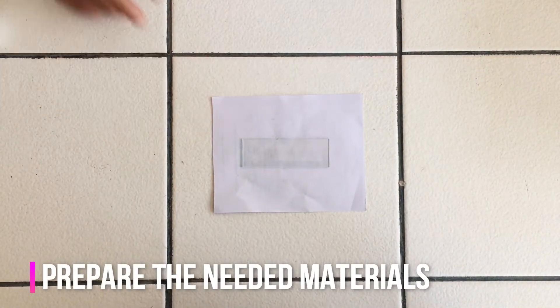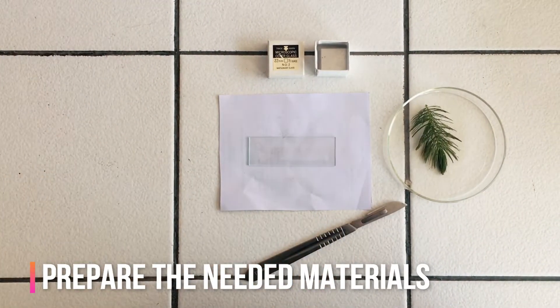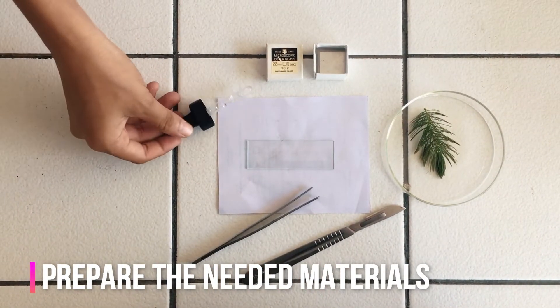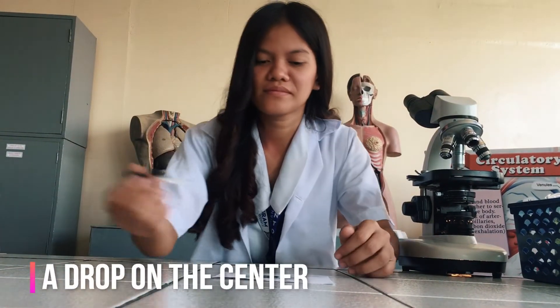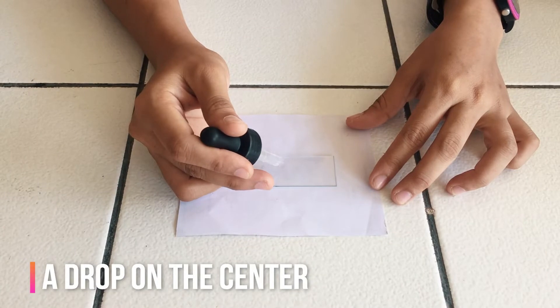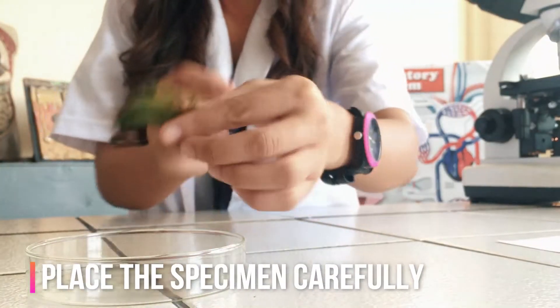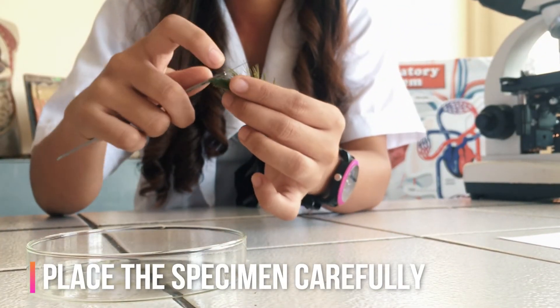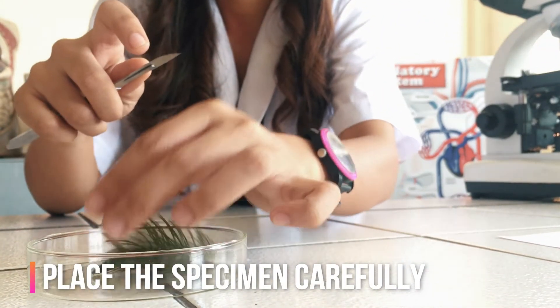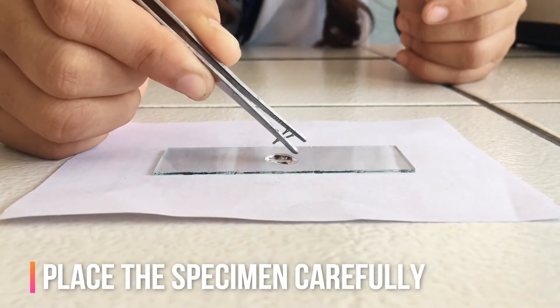The first thing to do is to prepare all necessary materials needed in making a wet mount. Place a drop of water in the center of the slide. Place the specimen into the drop of water, and if the specimen floats, add another drop of water on top of it. This reduces the possibilities of air bubbles forming.